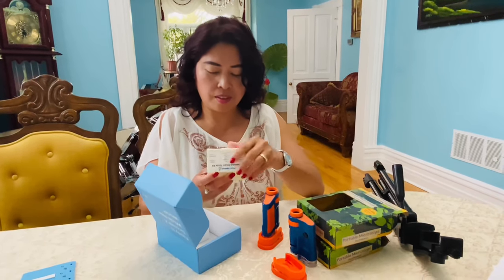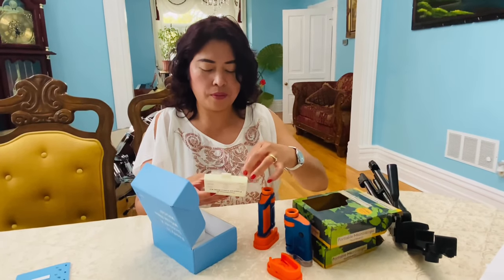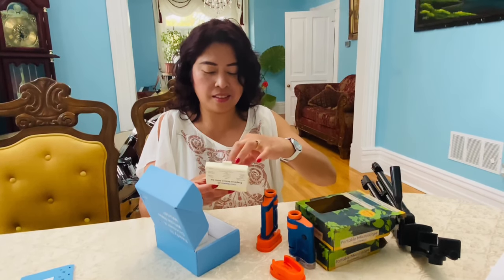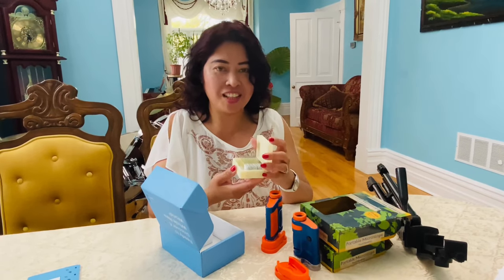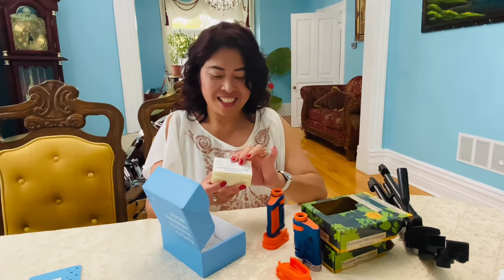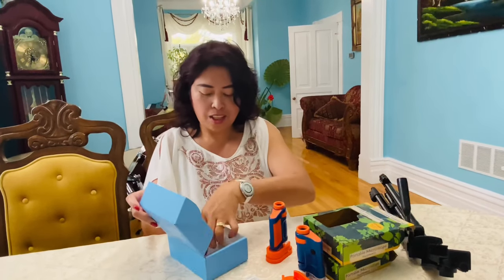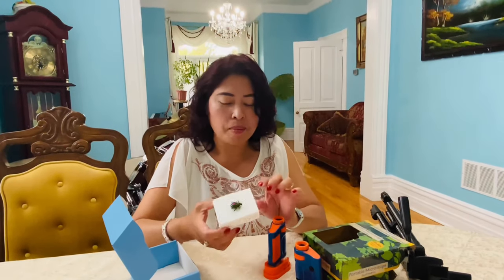In the kit, you can see slides one through twelve — for example, there's a mosquito antenna, butterfly, and different kinds of insects. We tried some today. It's interesting because you cannot see these things with the naked eye, but through this microscope you can see very clearly. After you're done, close it up. Later we're going to go in our backyard to find some bugs — but this is just an example with the beetle.